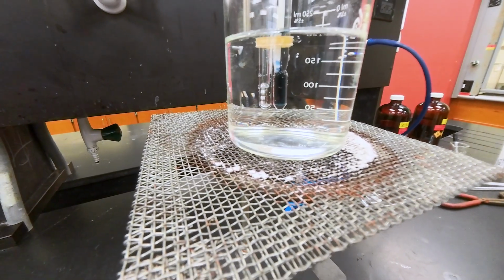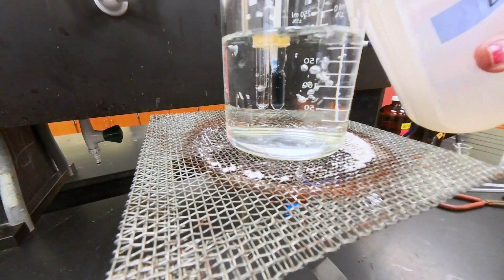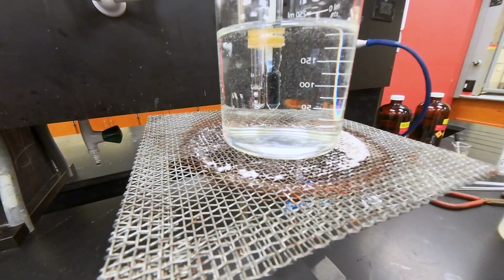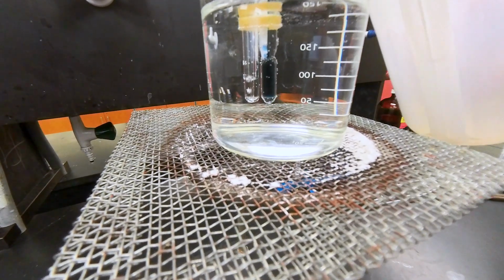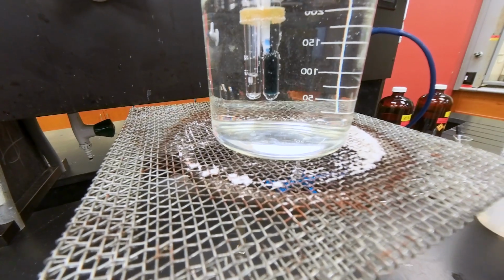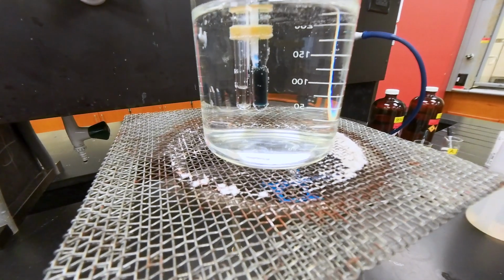If the temperature of the water is too high, it might take longer and the sample might evaporate completely. So I'm adding a few drops of water to help with that also. The bubbles are now coming out a little slower, but it is still too fast for me to record the temperature. So we are going to wait for the bubbles to come one at a time and then stop.